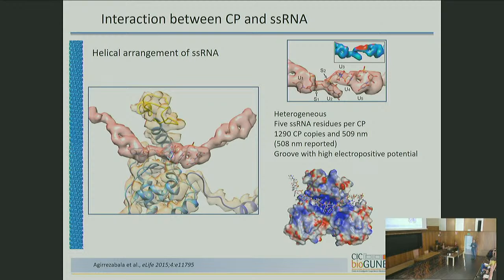So everybody in the field presented a poly-U as a model for the single-strand RNA, and that's what we did. But the few things that we could learn is that we have a stretch of 5 nucleotides per subunit, which fits really, really well with the length and the number of CPs. And also that no matter what the real orientation and structure of the RNA was, we always had one nucleotide sticking out from the rest. It was pointing to some kind of RNA binding pocket.